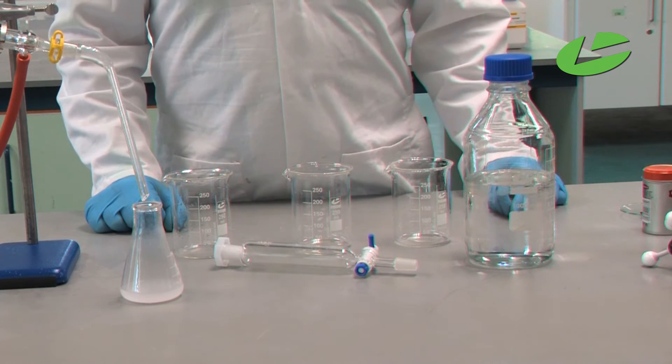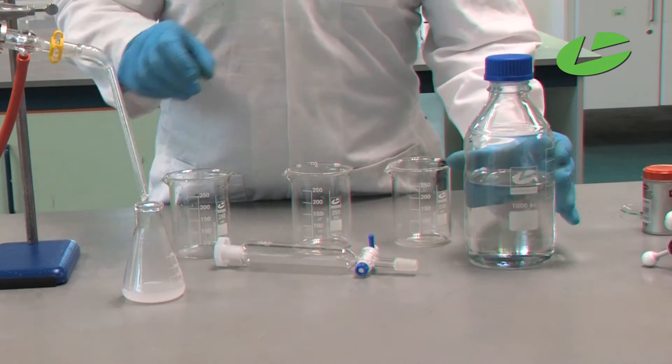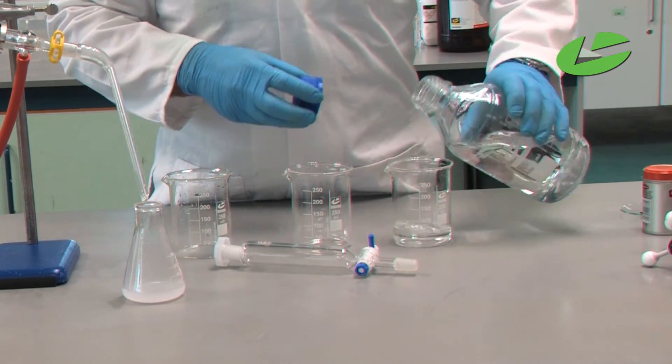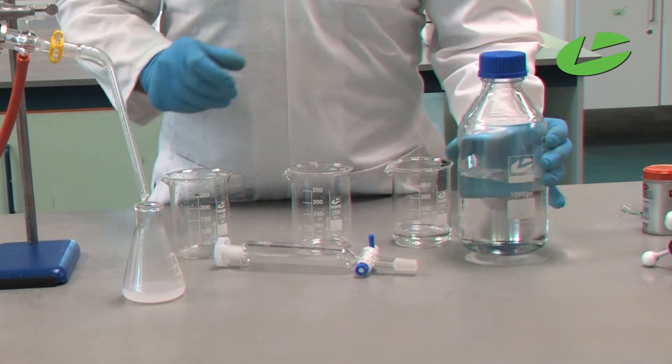The final part of this practical is the extraction of the clove oil from the water. For this we need some cyclohexane. Cyclohexane is immiscible in water because cyclohexane is non-polar and water is polar.